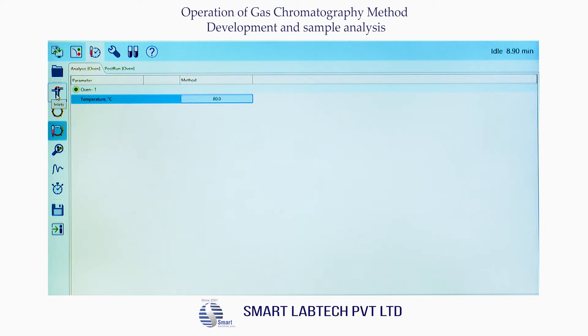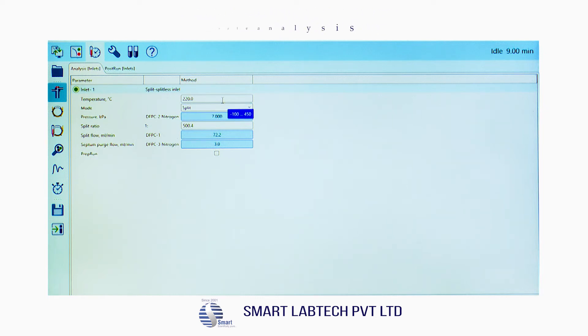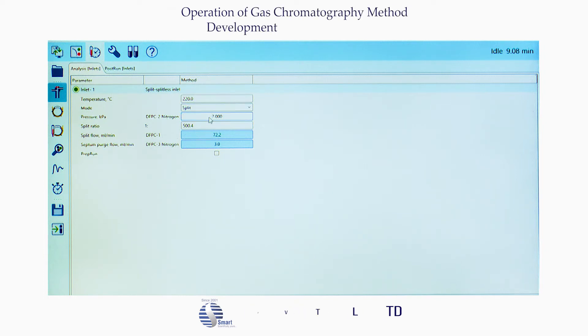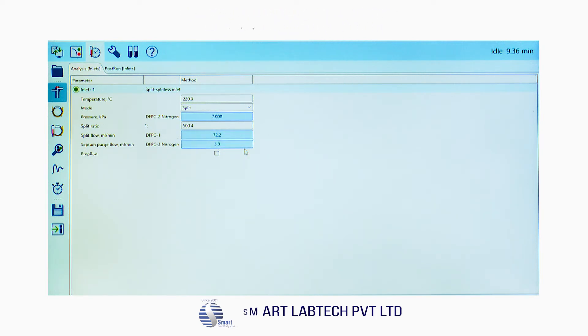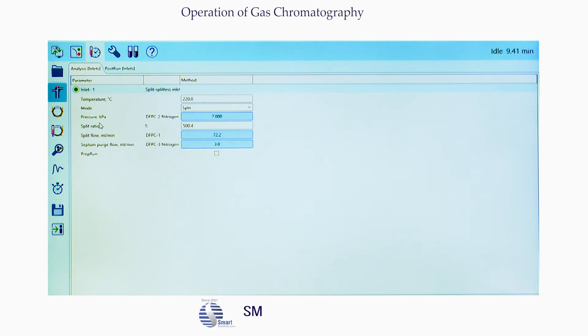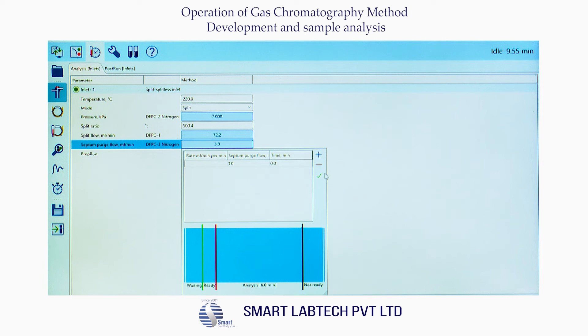Click on the inlet icon — the inlet screen appears. Select the temperature as 220°C and select mode as split. Default parameters appear in the method. Then select the split ratio as 1:500. Select split flow (ml/min) DFPC1 as 72.2, then click the tick mark. Set septum purge flow (ml/min) PFPC3 nitrogen as 3, then click the tick mark and it will be saved automatically.